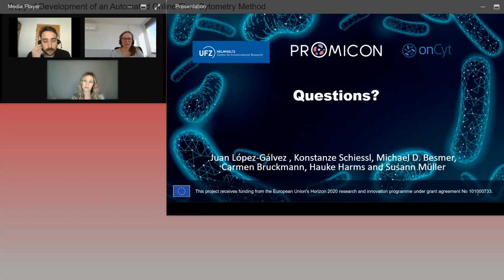So I think with the DAPI, we address some of these things, because DAPI is really independent of the cell activity, as far as I understand. With the scatter, it might be possible that one community is not always in the same place as we had it here with the fixed setup. So in that case, maybe I would start with just monitoring one strain as it's growing along the cycle. But maybe Juan, you can add some comments as well.